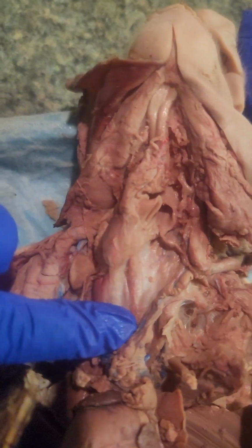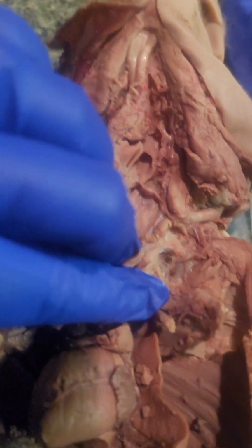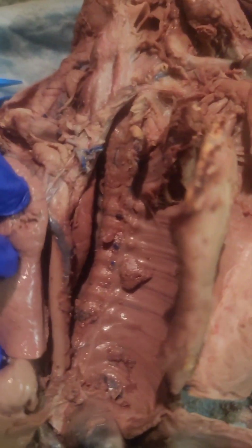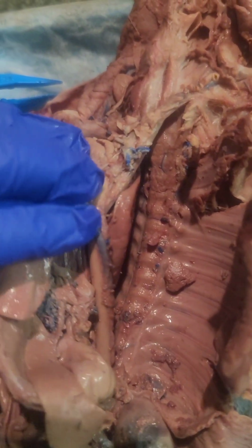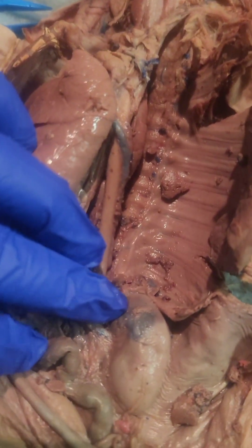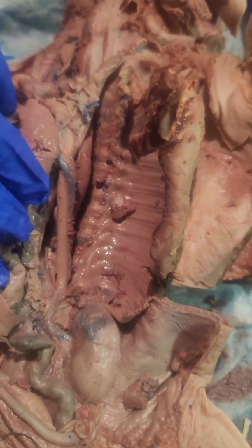Runs along the trachea all the way down. And I didn't take all my organs out because I wanted to leave them in there. And here it is, still all the way down the tract there.